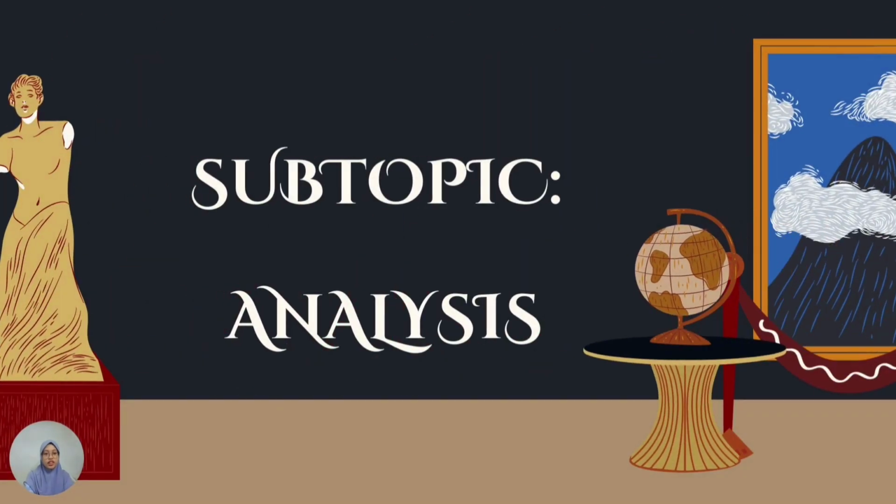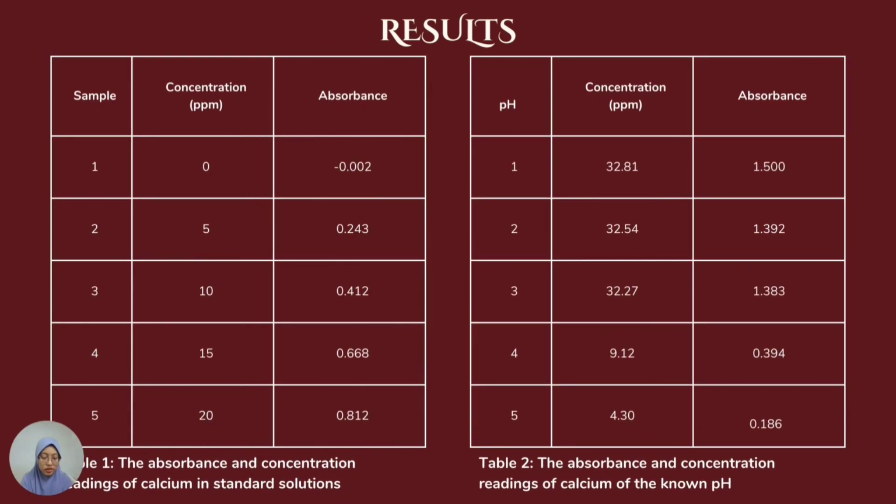That's it. Next, we'll go to the analysis. We want to analyze this experiment. Let's see the graphs. We have two graphs. The first table is about the absorbance and concentration readings of calcium in standard solution. So we have 5 samples here, with the concentration and absorbance values. The second table is about the absorbance and concentration readings of calcium at known pH. We have 5 pH used in this experiment: pH 1, pH 2, pH 3, 4, and 5.